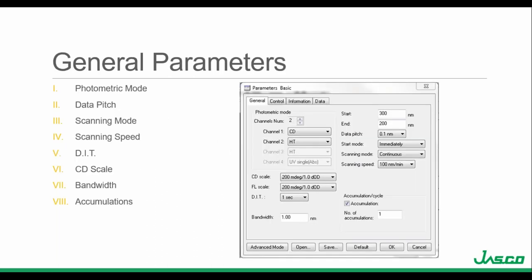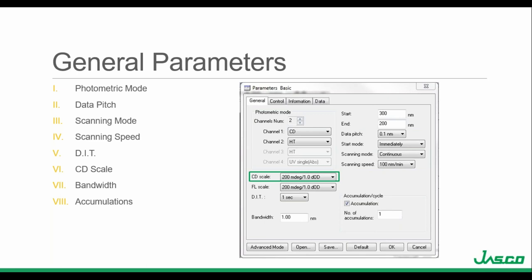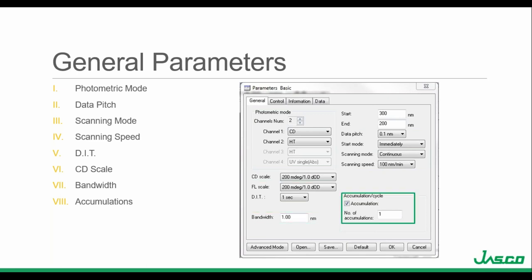Here is the parameter dialog box for the spectrum measurement program. This basic measurement program allows you to acquire CD data as a function of wavelength. The general tab displays the measurement parameter settings used to optimize the CD spectrum. You have: photometric mode, data pitch, scanning mode, scanning speed, DIT, CD scale, bandwidth, and accumulations.